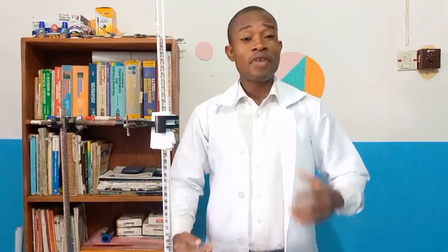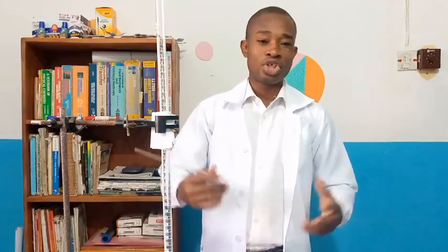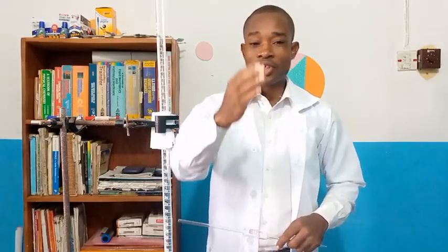When the table of values is displayed, part of what you are going to do is to complete the table of values. I'm not going to show you the complete table as regards what was obtained. I'll give you some of them. Are you following? Some values that I got. And then, of course, I will leave some gaps for you to fill. So you have to copy and complete the table. All right? Okay, so let's move on. I'm going right away to carry out the experiment. And of course, the table of values will be displayed.